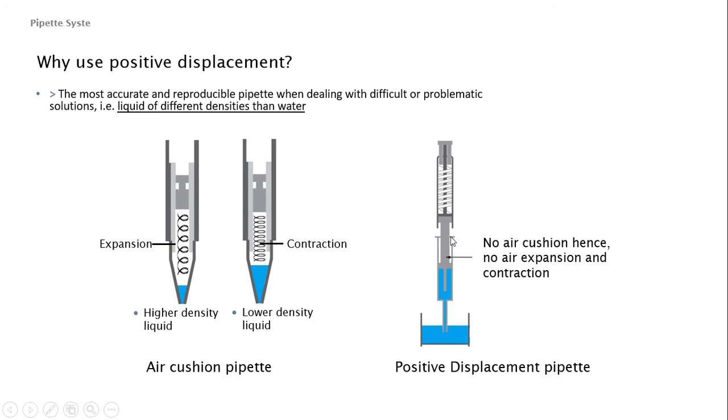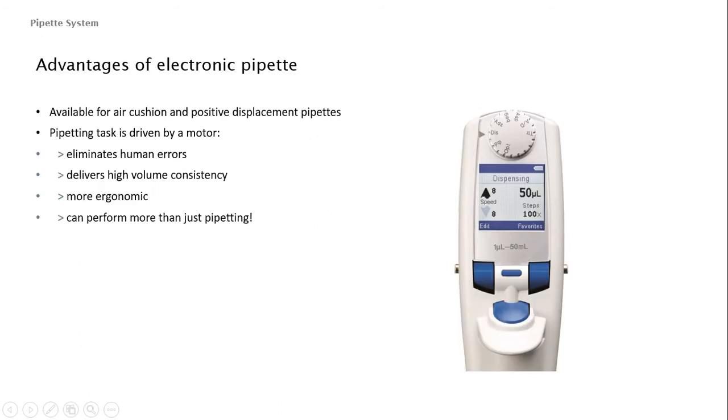If you will see, this one has a direct contact, but the one in direct contact is the pipette tip, not the piston.